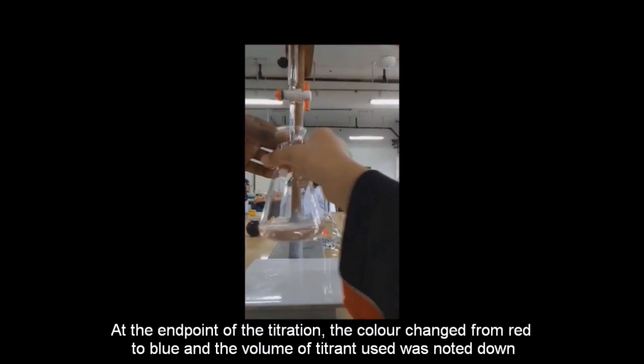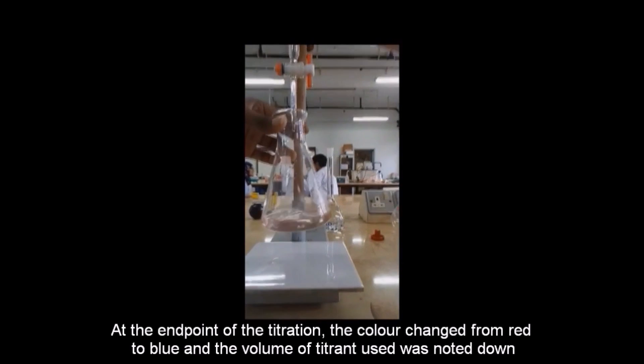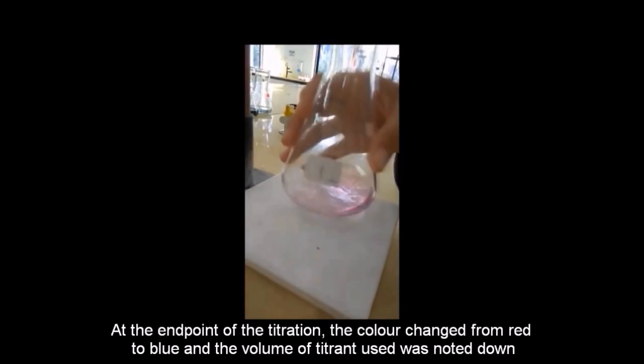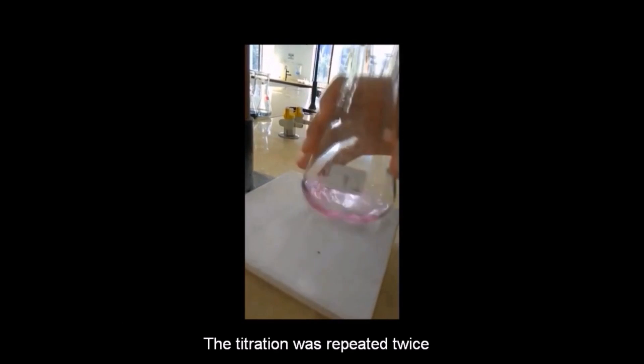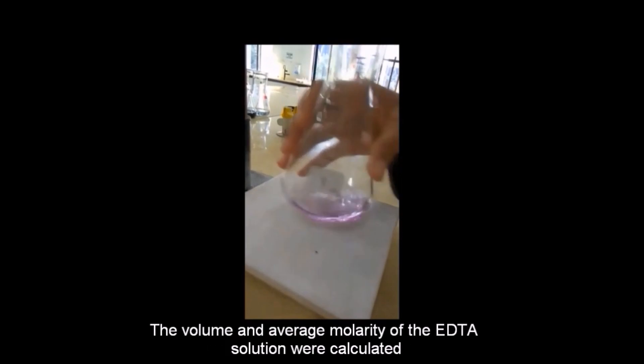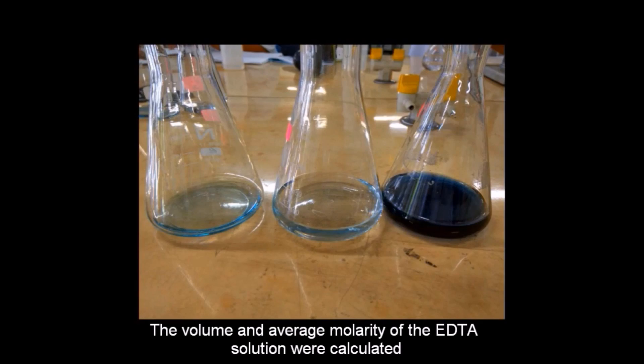At the endpoint of the titration, the color changed from red to blue and the volume of titrant used was noted down. The titration was repeated twice. The volume and the average molarity of the EDTA solution were calculated.